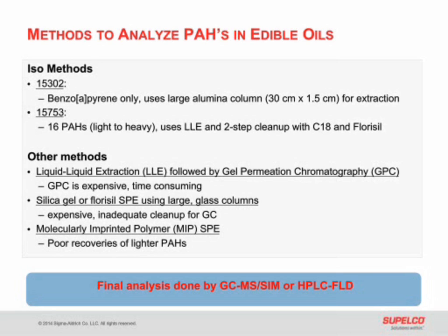Other methods include liquid-liquid extraction followed by gel permeation chromatography, or GPC, silica gel or Florisil SPE using large glass columns, or molecularly imprinted polymers, or MIP SPE. These other cleanup techniques sometimes can be time-consuming, expensive, or provide inadequate cleanup.